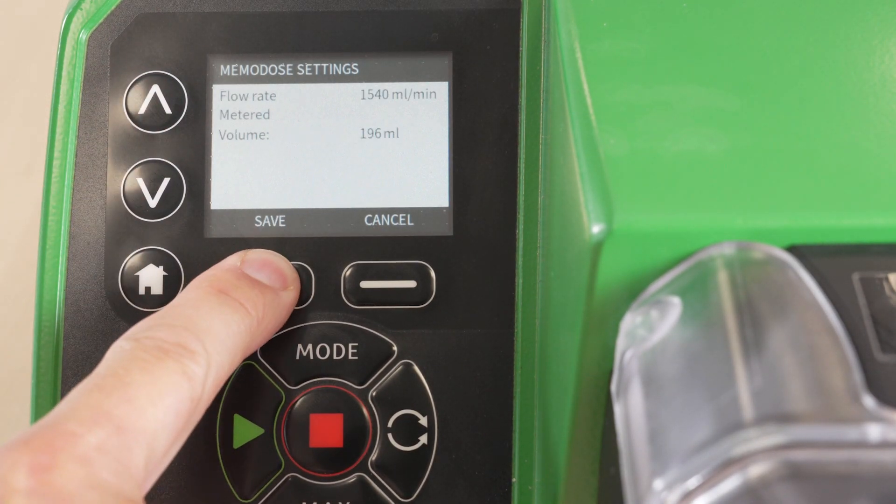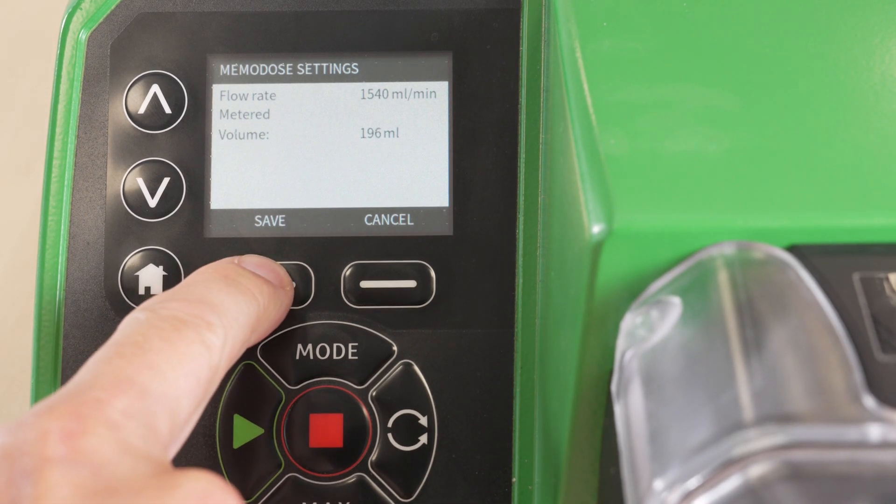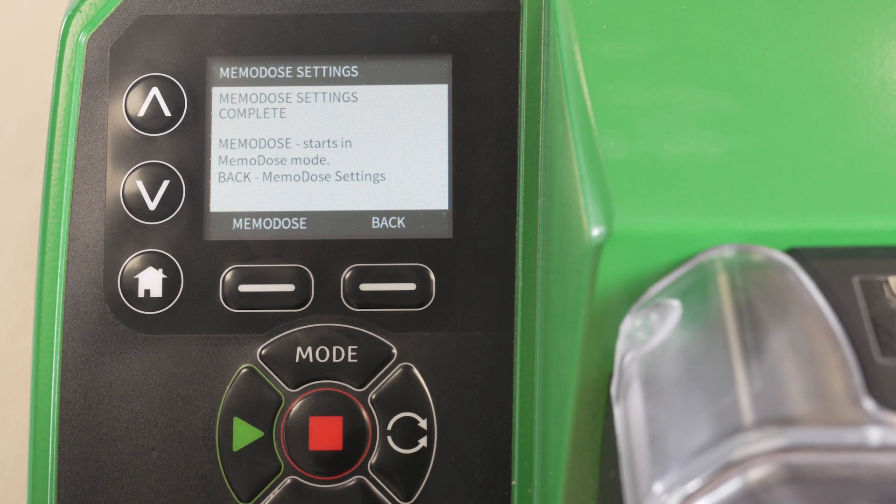When you are happy with the dose, push select and save the settings. Your Memodose is now complete.